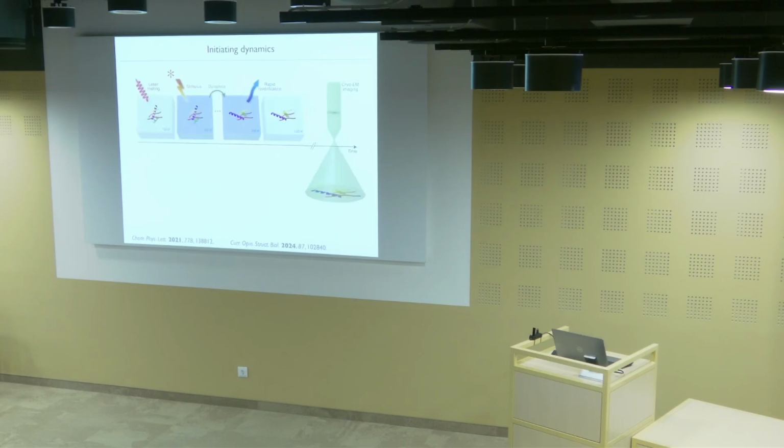All right, so what I haven't talked about yet is how you would use these experiments to look at protein dynamics, right? And this really all boils down to the question of what the stimulus is. If you have a photoactive protein, you could certainly come in with a second laser pulse, and we've started doing experiments like this now. You could also, by just cranking up the power of this laser, do a temperature jump experiment, and we've also started doing some of these experiments. I'll show you some data later.